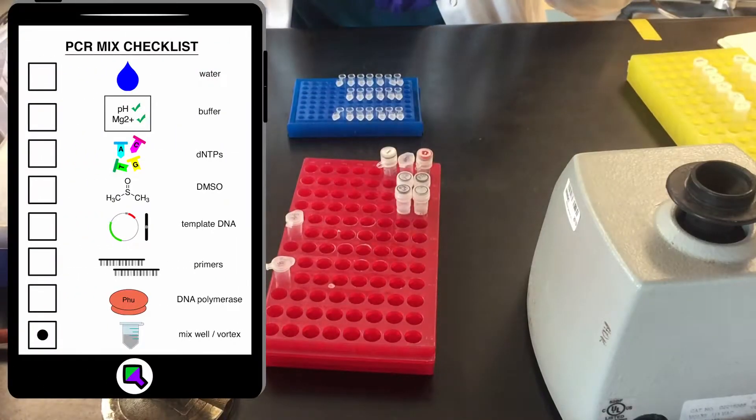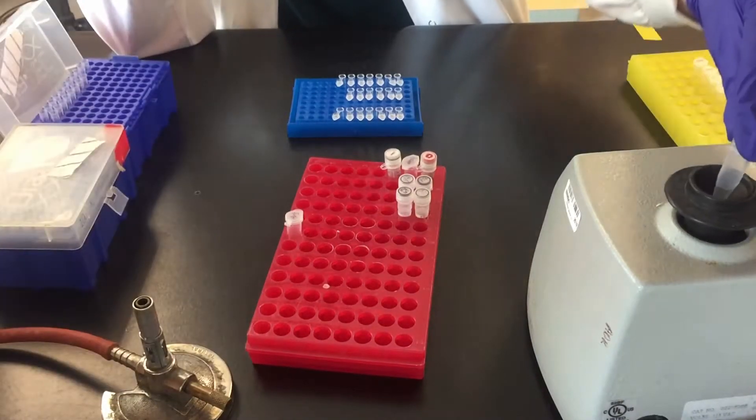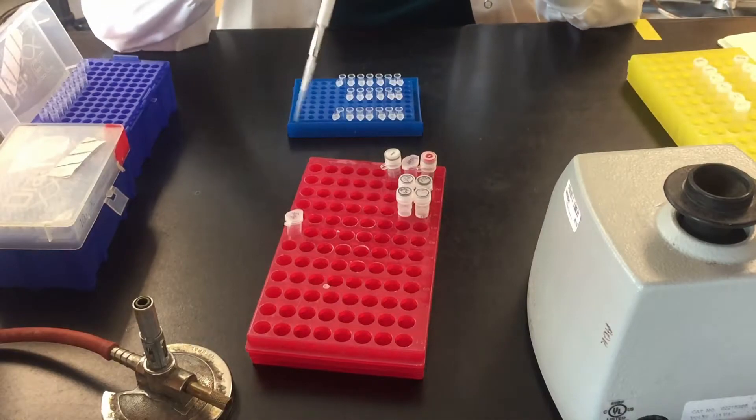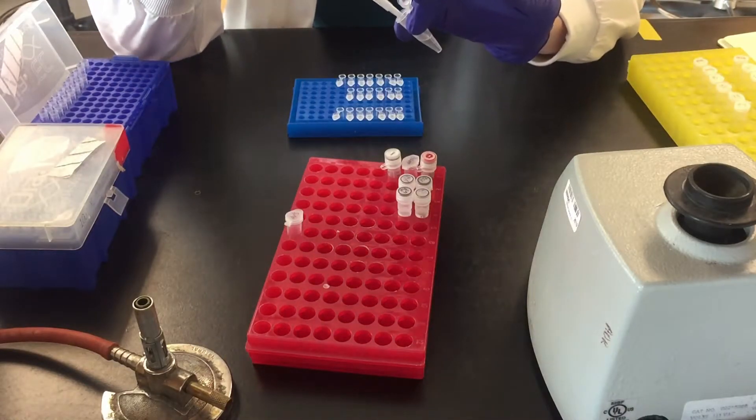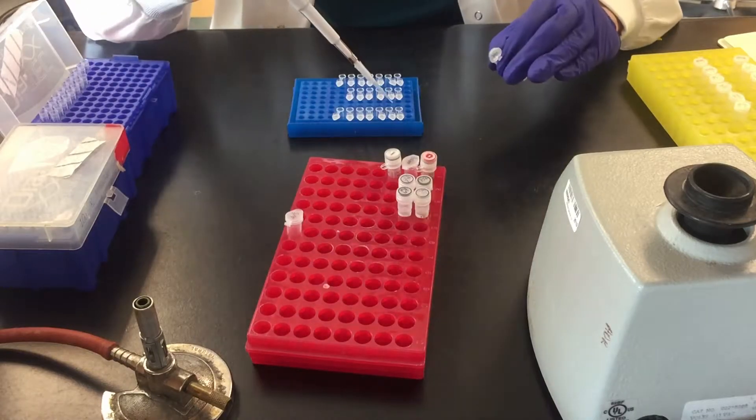It's very important to mix well by vortexing after you've added all the reagents. This is because DMSO and whatever the enzymes usually diluted in is more dense than water. We want all the reagents to be locally available for optimal polymerase efficiency.